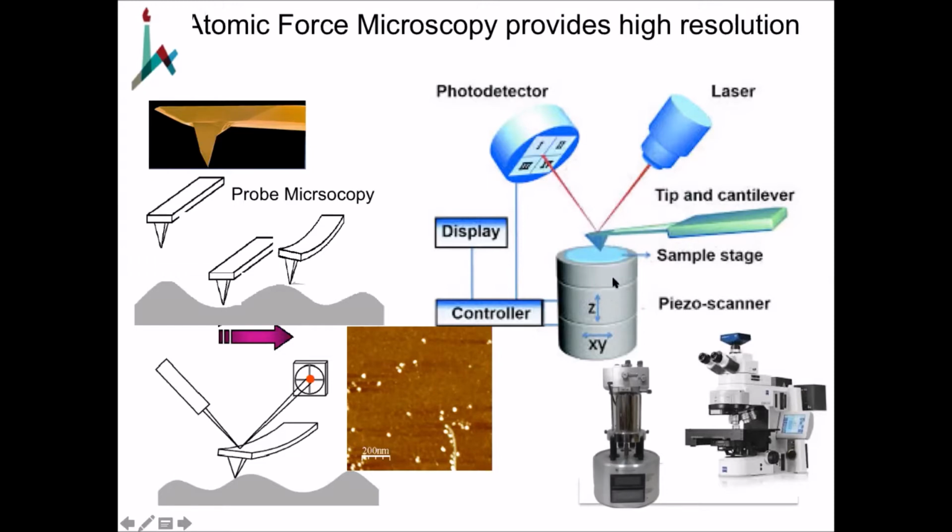And then you can bring the sample, let us say, up to the tip, and the surface forces start to make this bend. And when this bends, the ratio changes. That is sent to a controller, which then adjusts the piezo such that the piezo reduces the effect and brings the detector back to its original position. What does that mean? It means that you initially have it reflecting. These 2 quadrants are being affected for various reasons. I won't go into why only 2 quadrants, but that's the fact, okay?